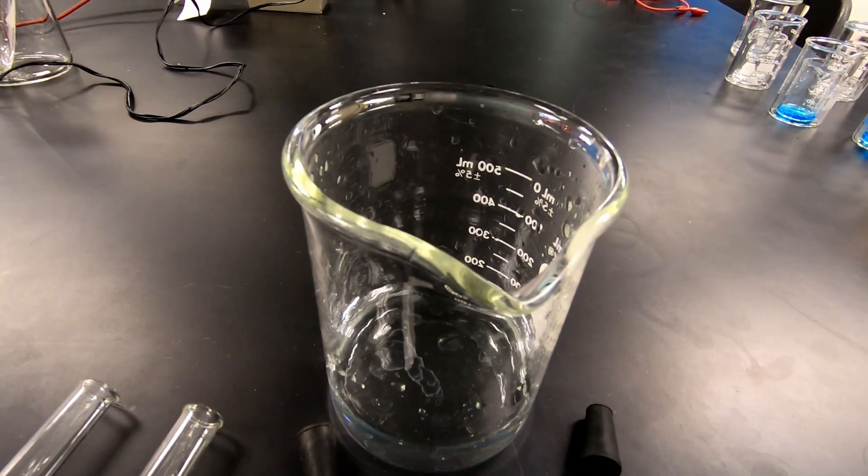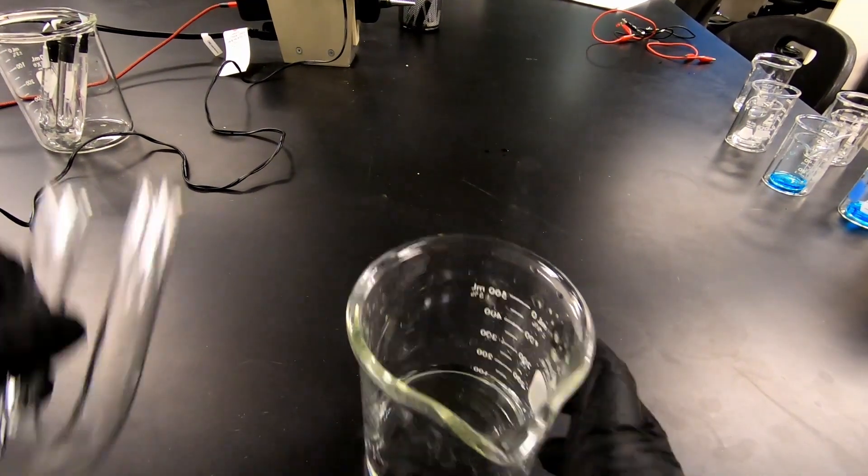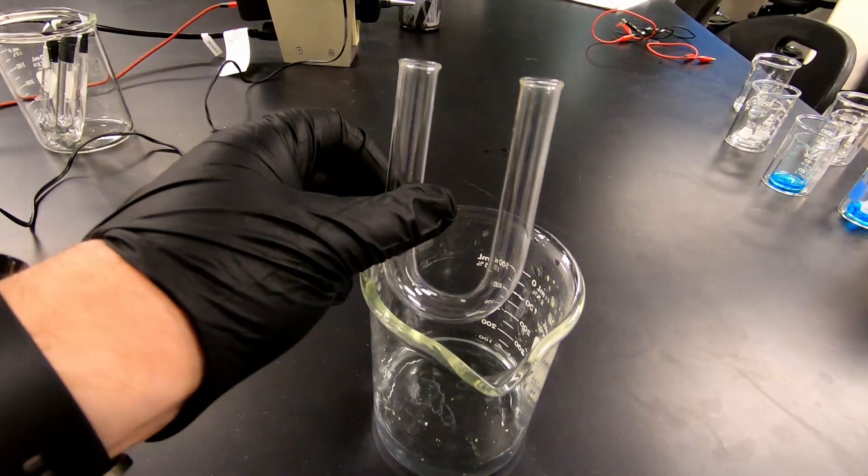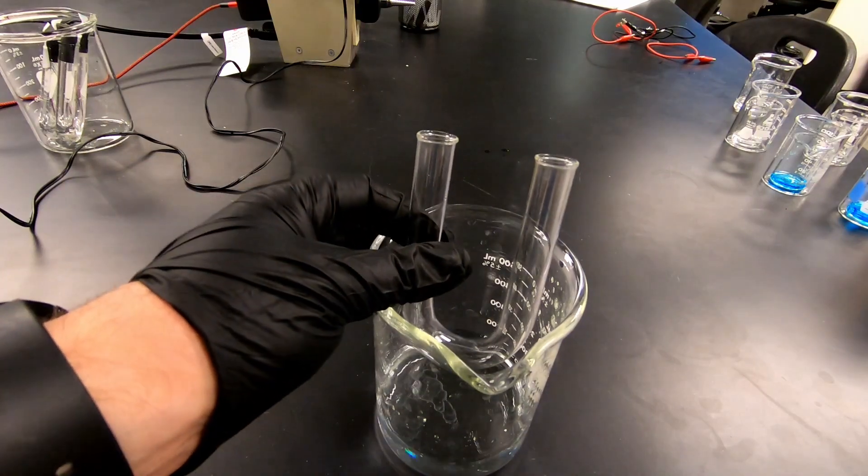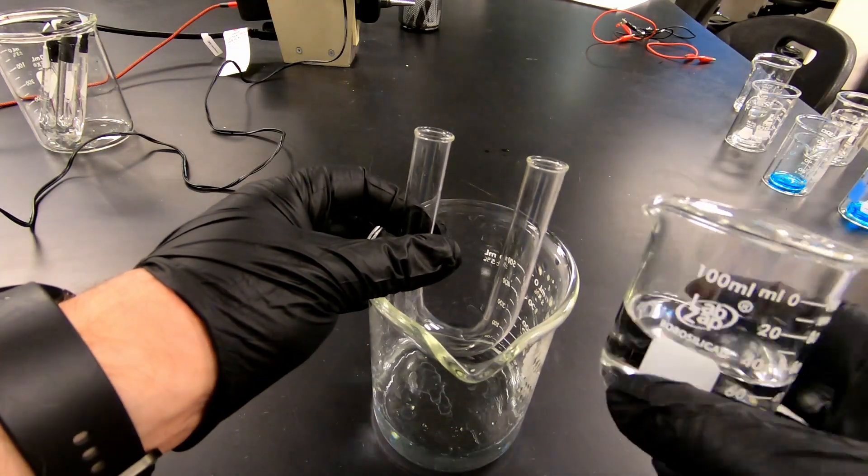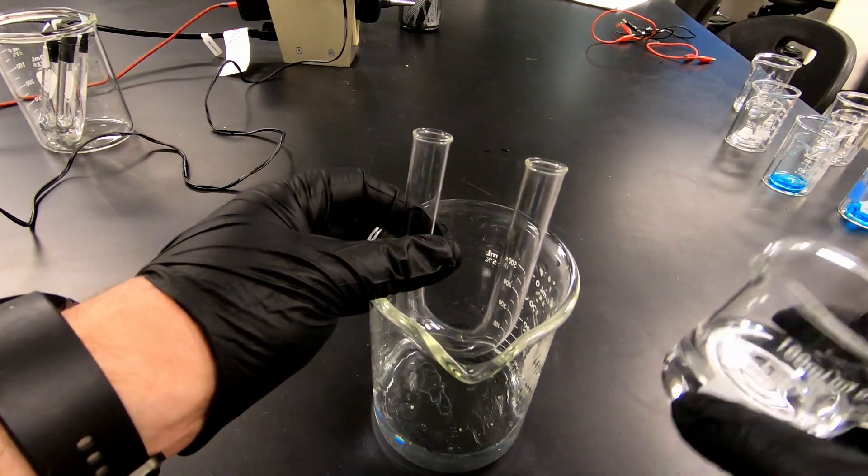So what I want to do first is fill our U-tube with our salt for the salt bridge. Just to help with spills, do it over your waste beaker and take your secondary container of your salt. You're using sodium sulfate.